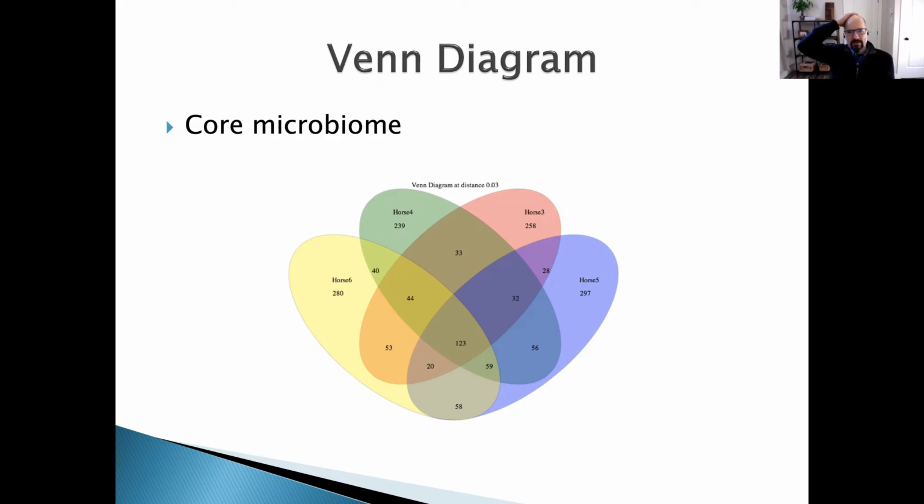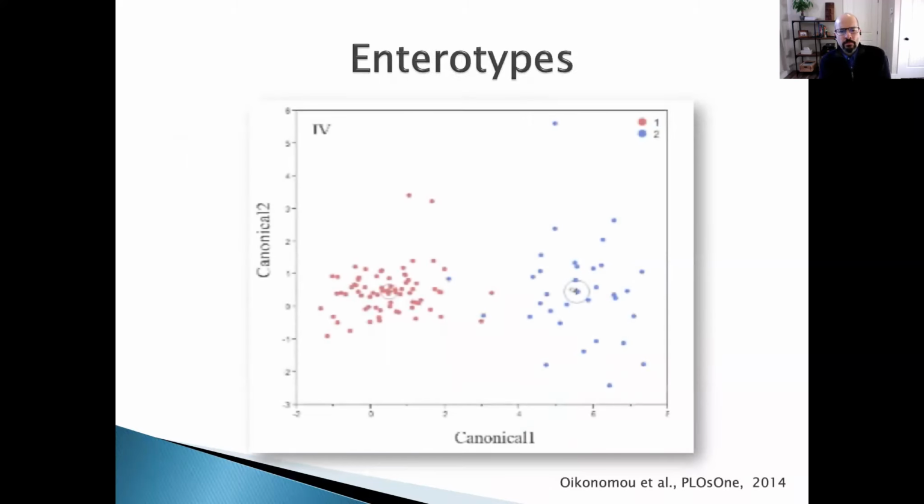Okay, so now that we evaluate the microbiota of 10 horses or 20 sometimes, it's just a huge mess, and you can see it's not very clear. So that's why I never see this type of analysis anymore, but it's here for you, for your reference.